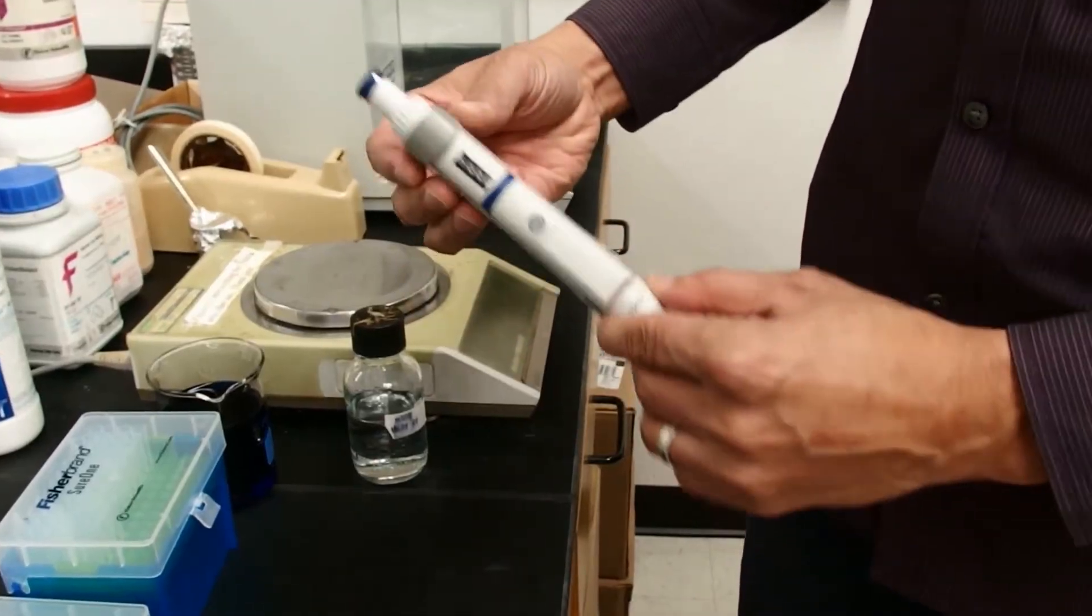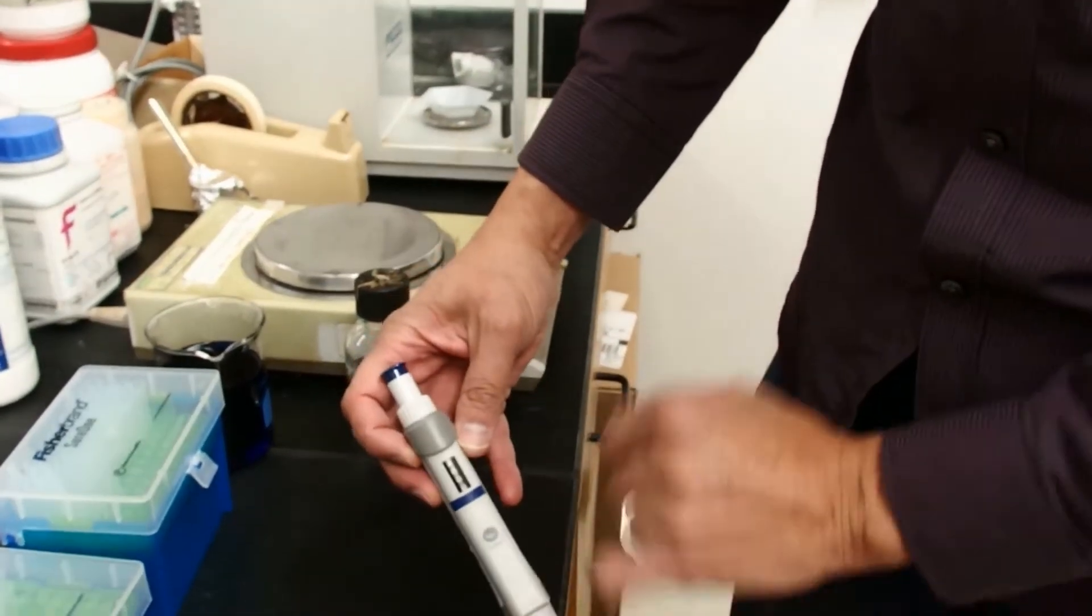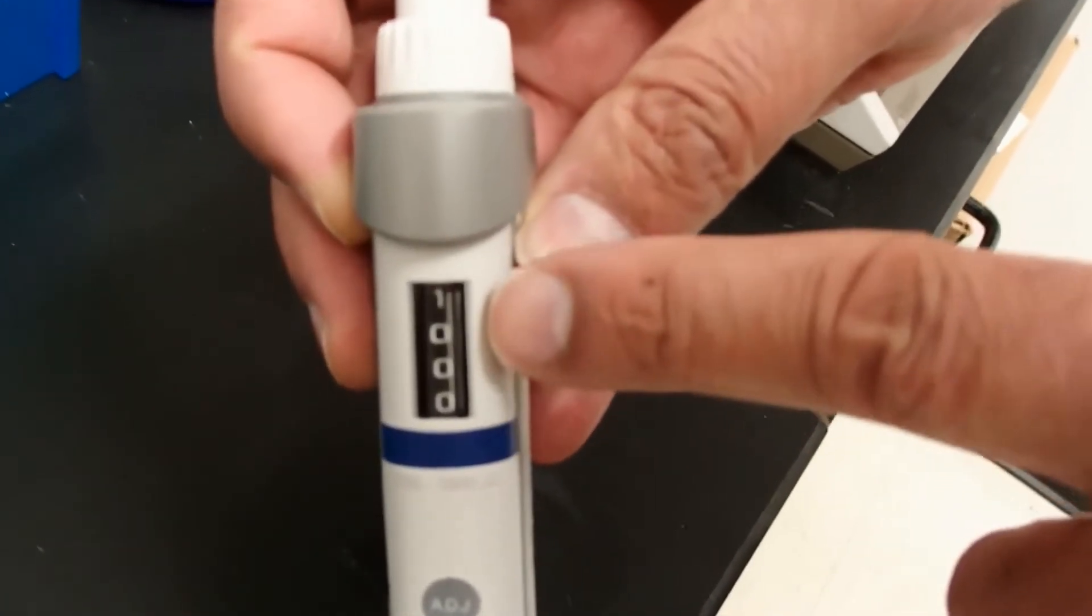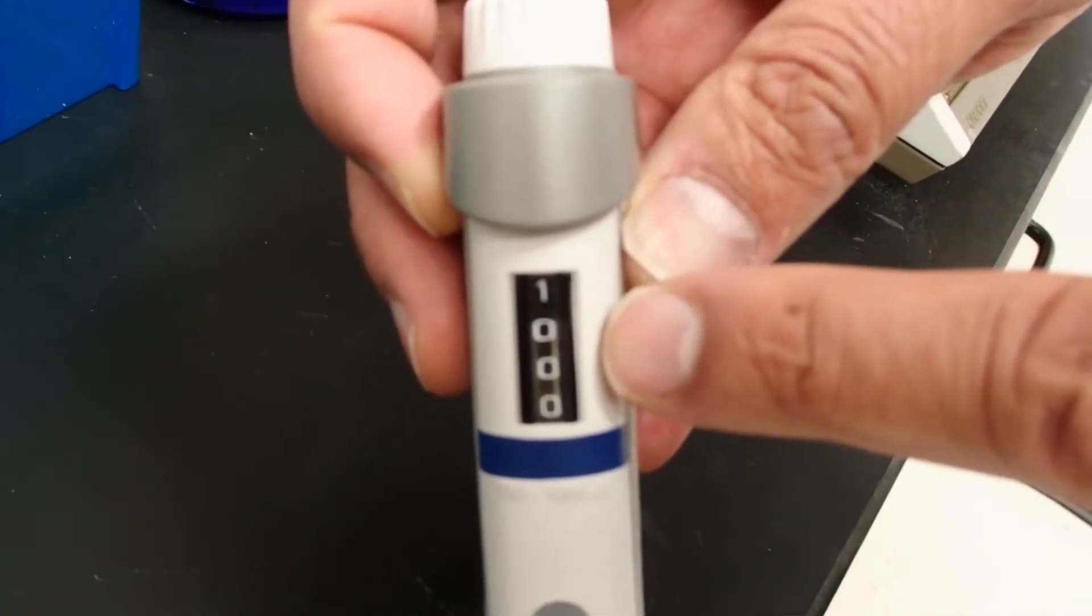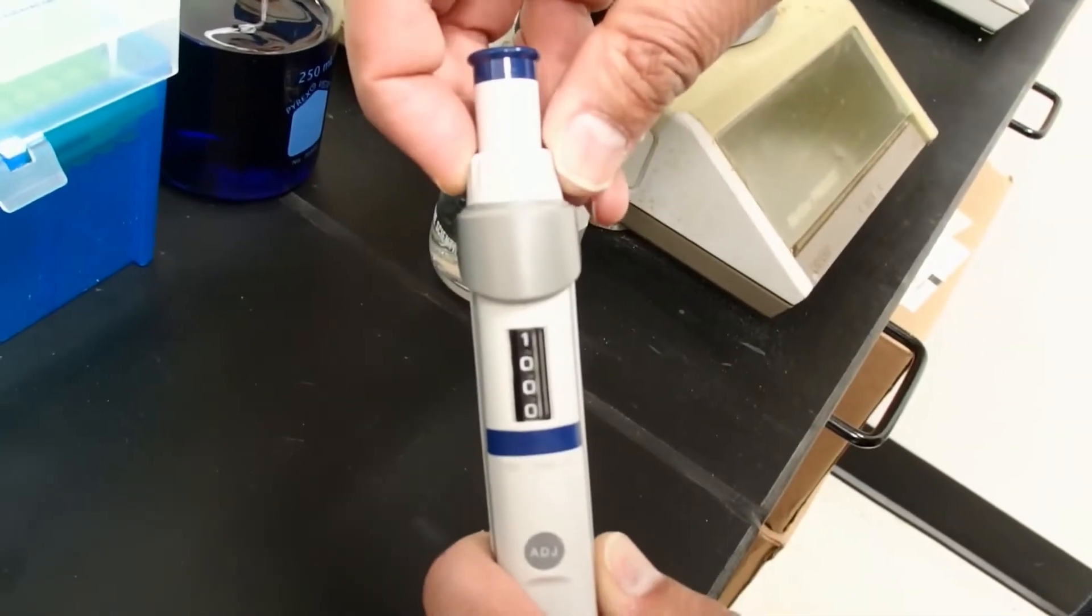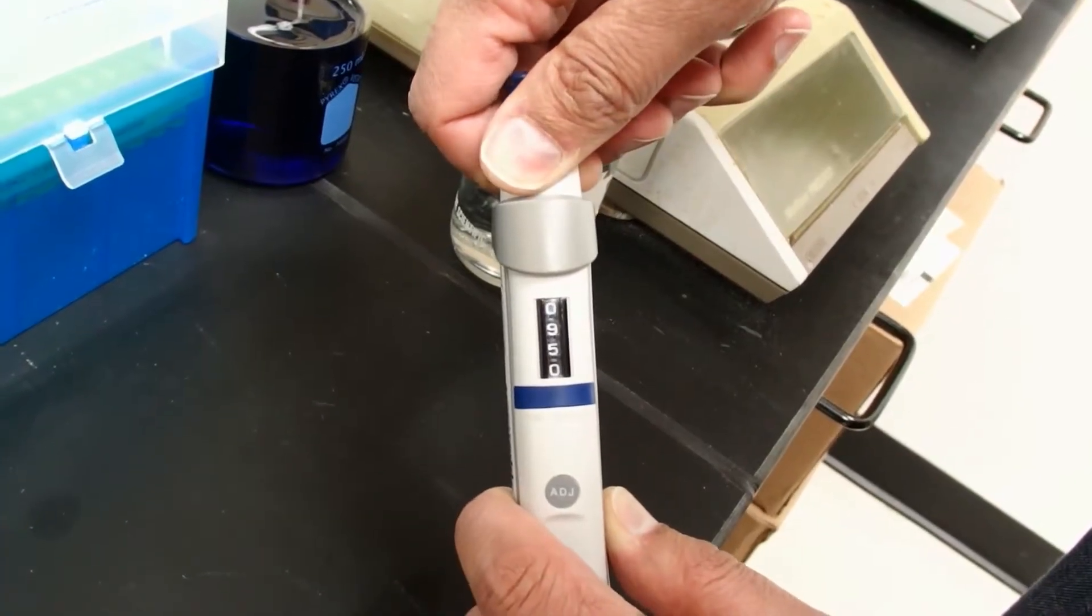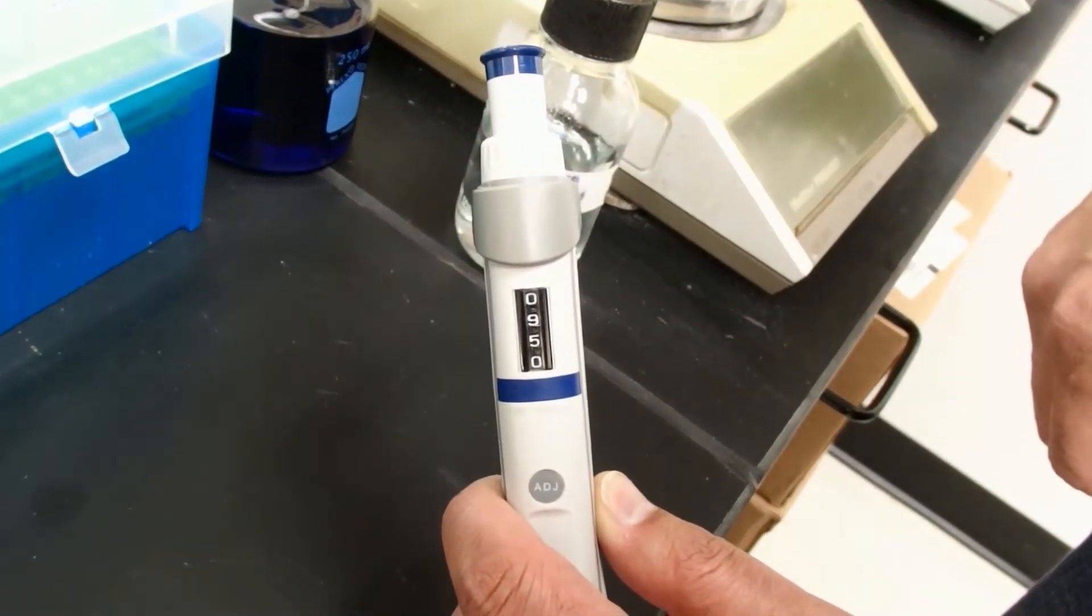It has a number of parts. Here we have a screen where we can determine how much volume we're going to pipette. Right now it's set to 1,000 microliters. To change that, we turn this dial. Now I have changed it to 950 microliters.